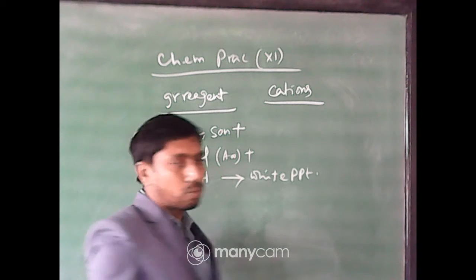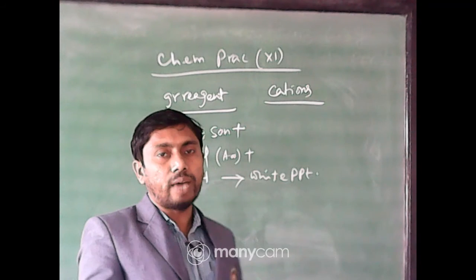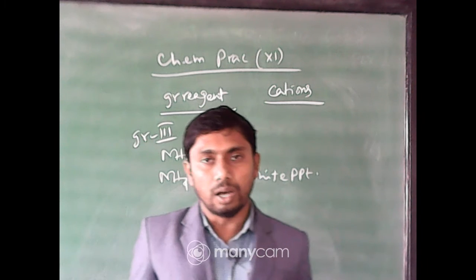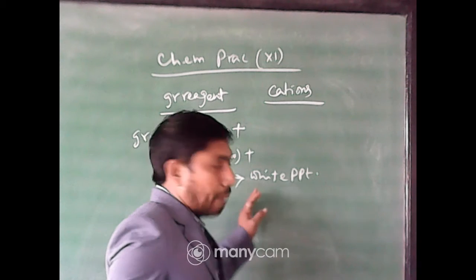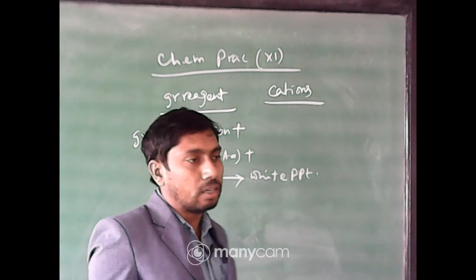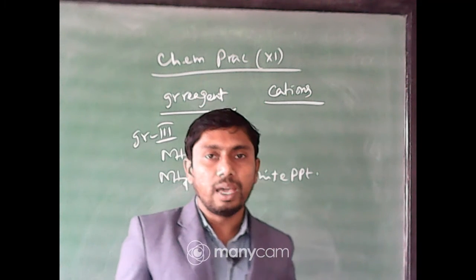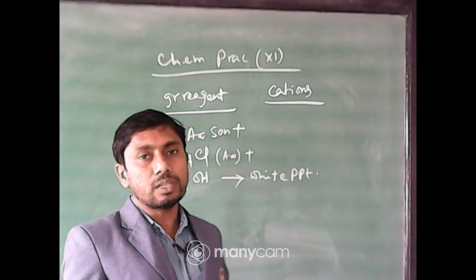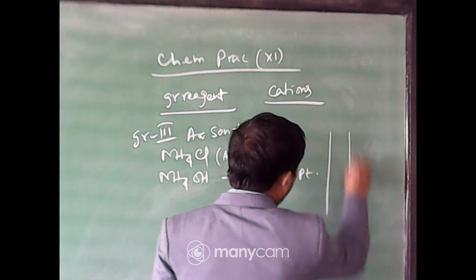Okay. So, this white PPT should be dissolved by HCl, and you have to add blue litmus solution so that the pH of the solution will not go too low with respect to the addition of HCl. After addition of the blue litmus, it will gradually turn to red because of the addition of HCl, and when the PPT is just dissolved, again add NH4OH to that solution so that it forms the PPT again, and the PPT will be floatable on the upper portion of the test tube.